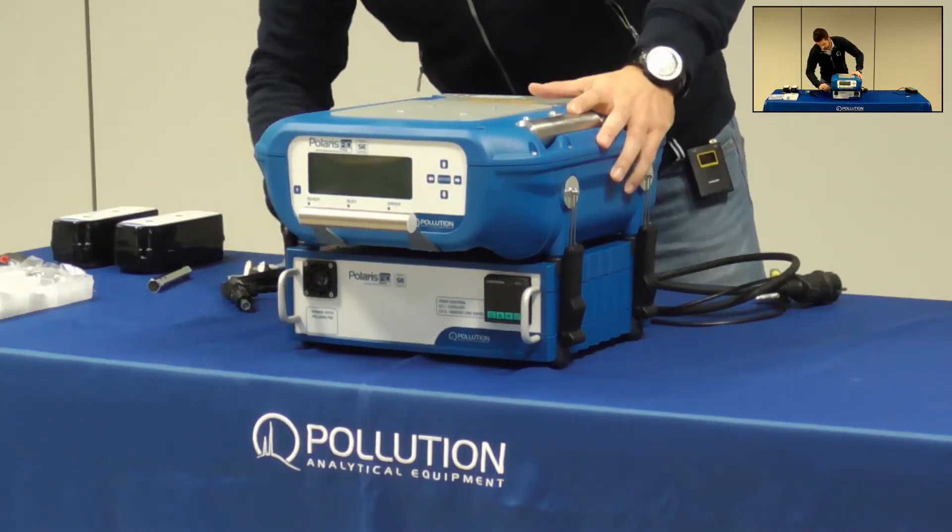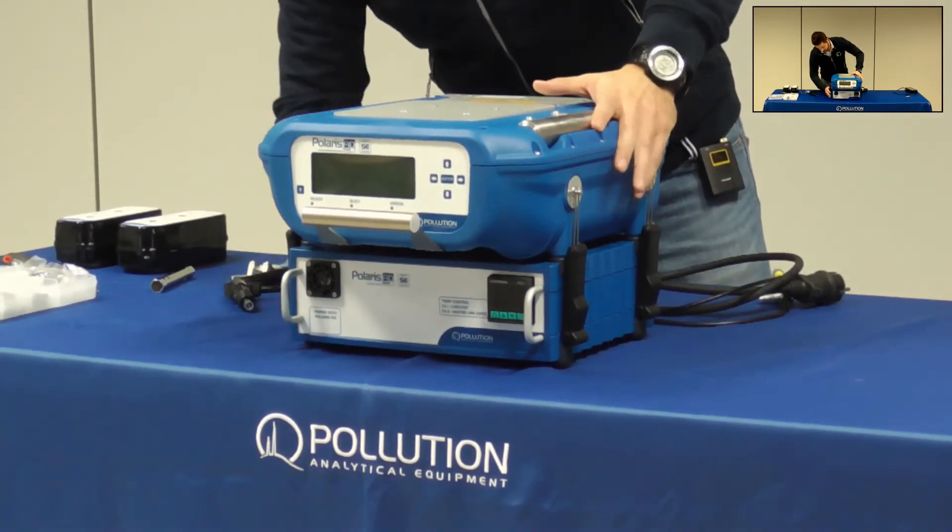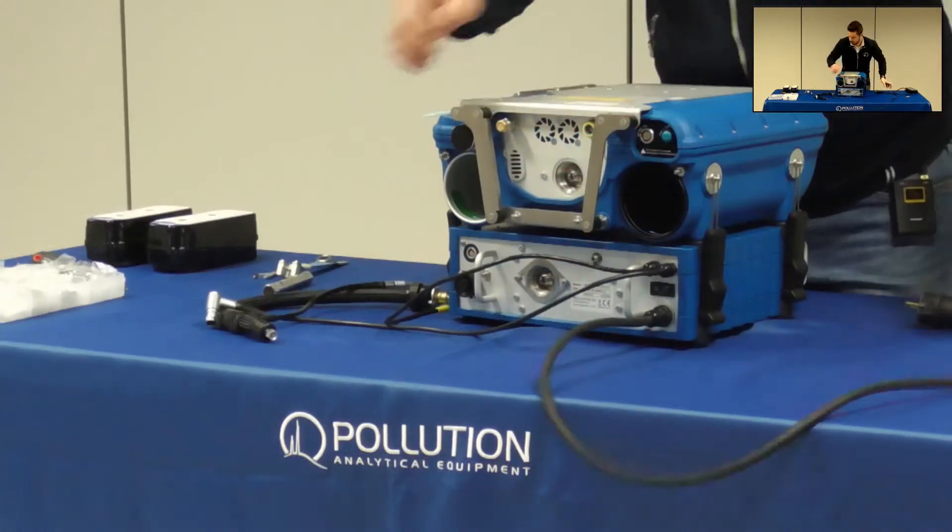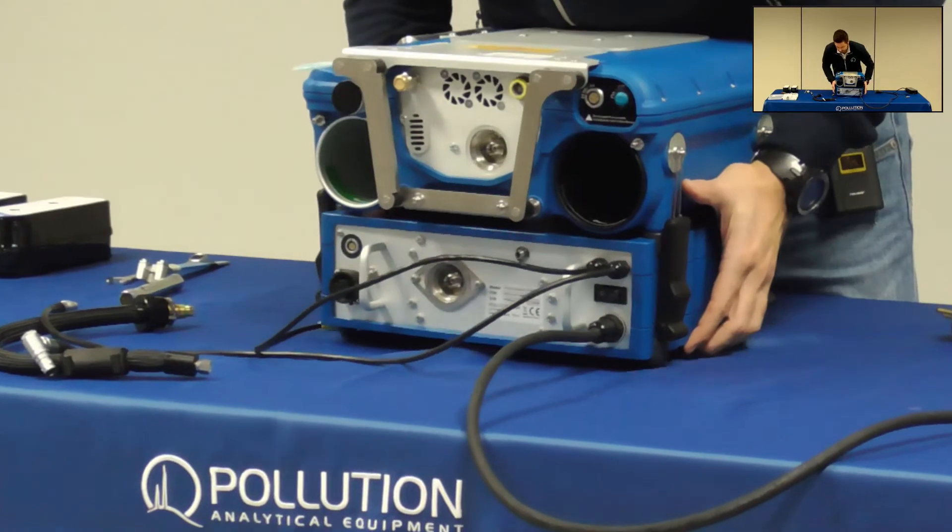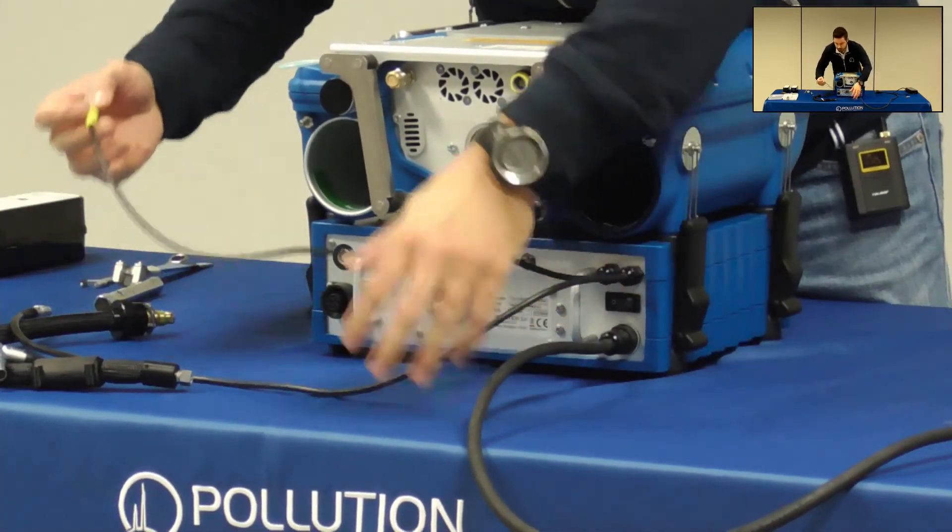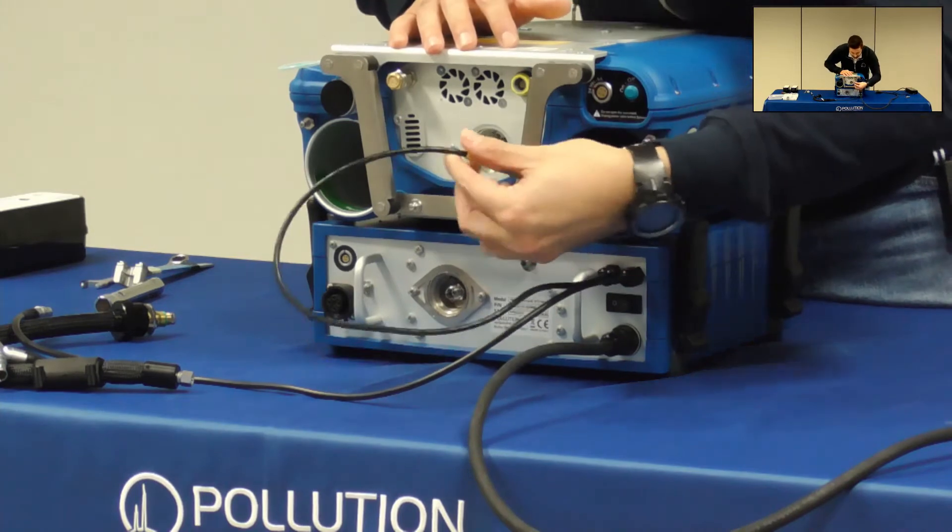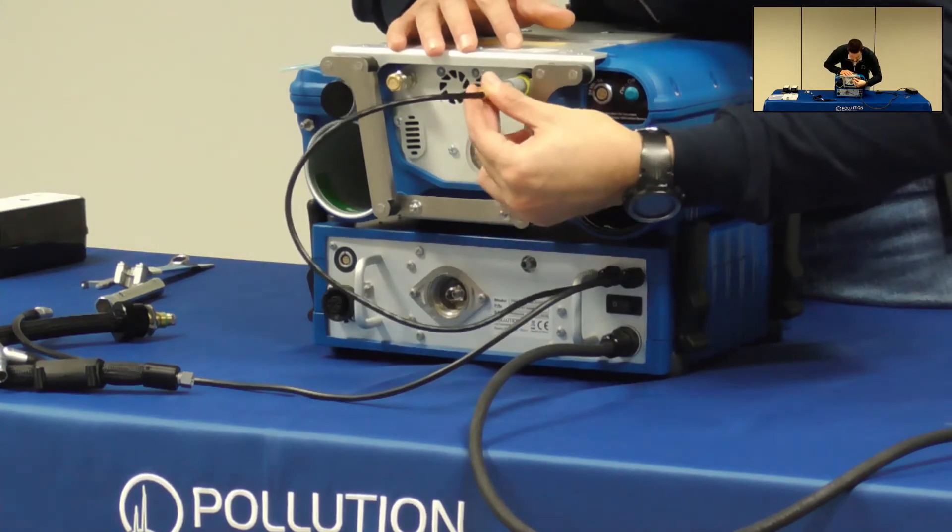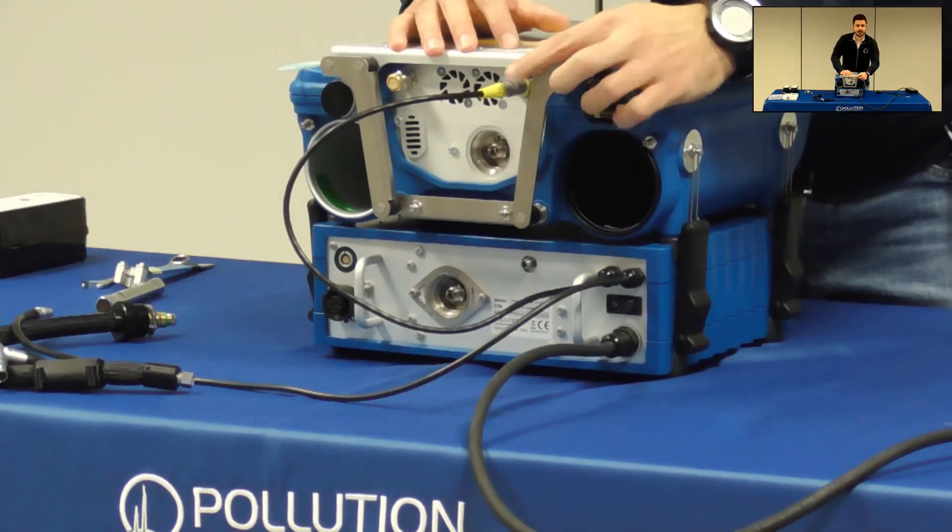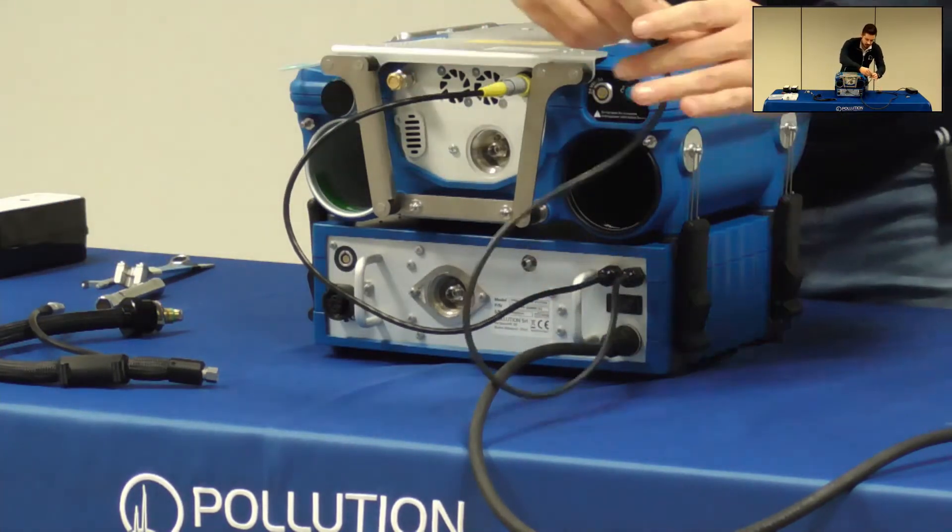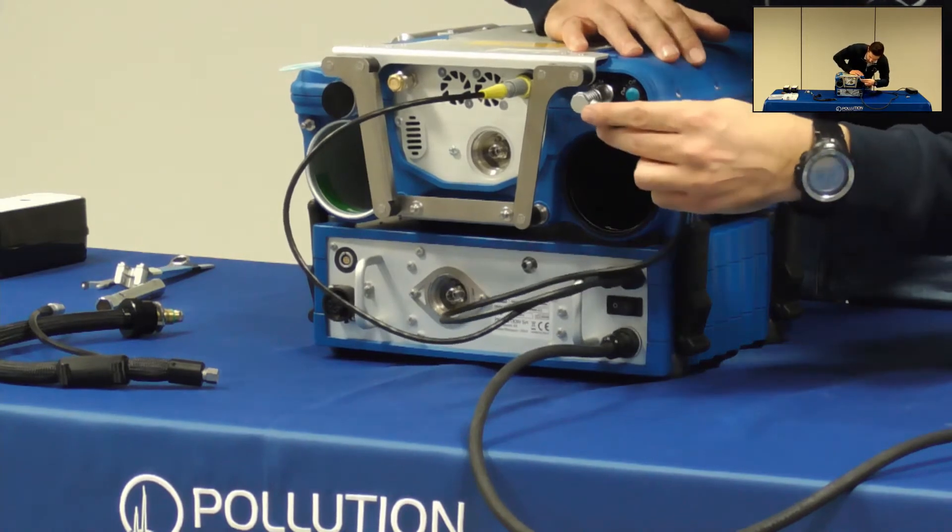Going on the back of the instrument there are three cables that need to be connected. The yellow one is for data transfer between the two devices and needs to be plugged in here. The power cable goes from the docking station to the plug next to the blue button on the Polaris.